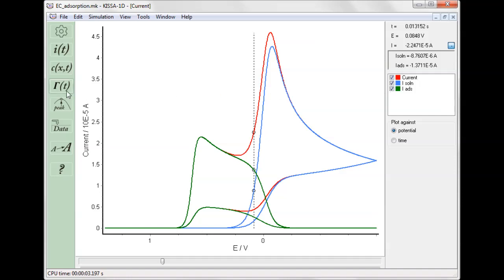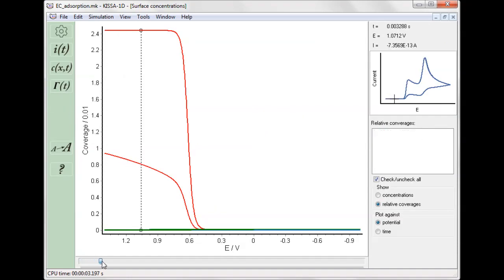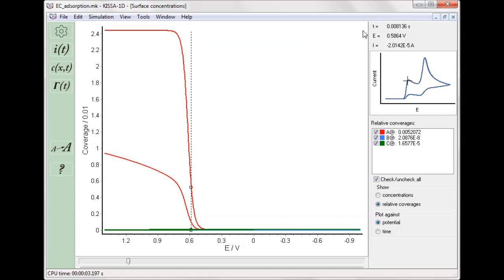Computed surface coverage by adsorbed species are accessible by clicking the surface concentrations button on the tool panel. Again, the values displayed on the right-hand side correspond to the time selected using the slider at the bottom of the window.